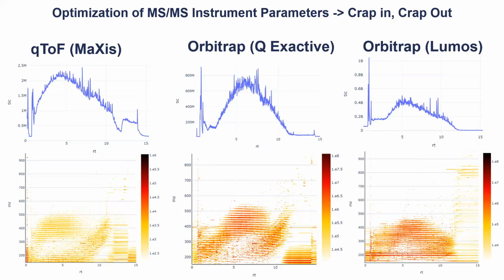And here on this map on the bottom, you can see already how you get more intensity at the MS1 level. This was exactly the same sample injected into three different instruments. The heat maps basically indicate mass versus retention time, and the more red color indicates high intensity. So we cover similar ranges of molecular space in the chromatography.